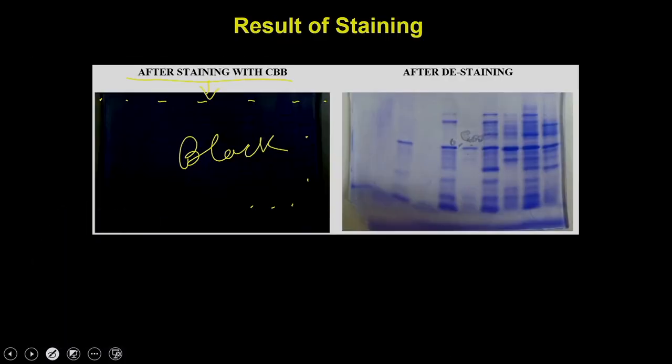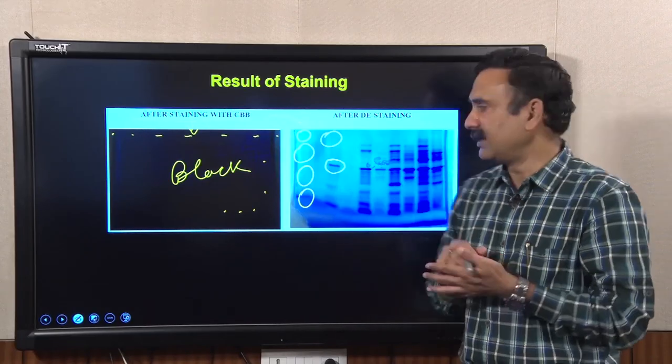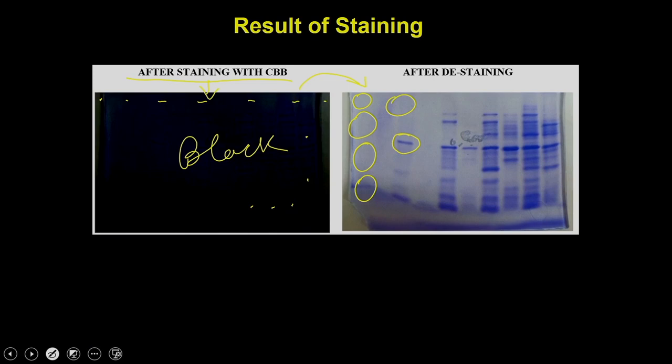So once you do the de-staining step, the Coomassie Brilliant Blue is going to be removed from the non-specific polyacrylamide gel, but the place where you have the protein, it is not going to be removed because it has a higher affinity for the Coomassie Brilliant Blue. So as a result, you are going to start seeing the protein bands.